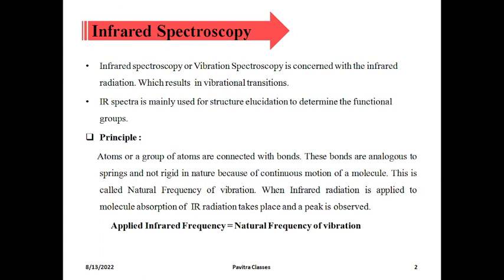Infrared spectroscopy is also called vibrational spectroscopy, concerned with the infrared radiations which result in vibrational transitions. So it collects the vibration of the molecule. For that purpose it is also called vibrational spectroscopy. IR spectra is mainly used in structural elucidation. If an unknown compound is there, by functional group elucidation, structure elucidation can be done, naming can be done, and then the compound can be identified.